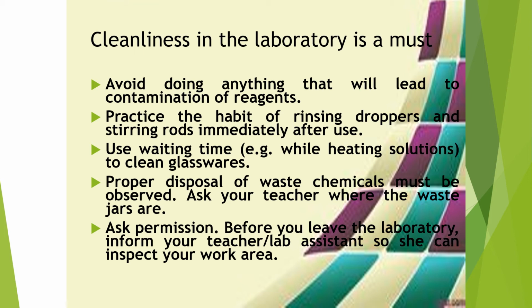Proper disposal of waste chemicals must be observed. You ask your teacher where the waste jars are. Ask permission before you leave the laboratory. Inform your teacher or laboratory assistant, so she can inspect your work area.